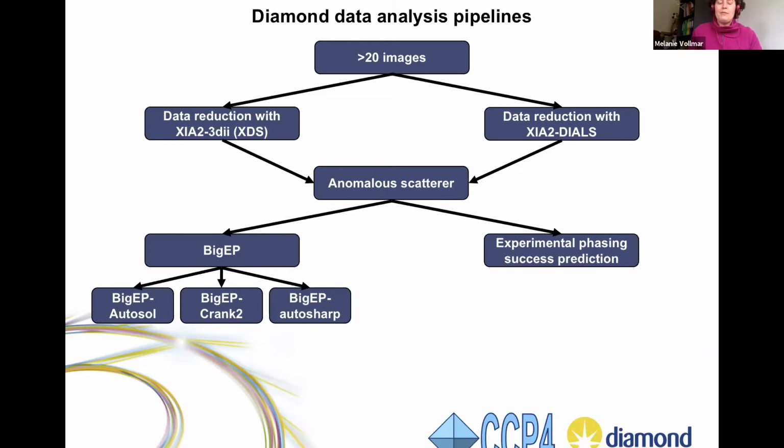There's a lot of parallel running going on here. And we also trigger in parallel my prediction tool here. So all of the graphs I showed you before about the features identified from the public data and everything goes into this prediction tool here.